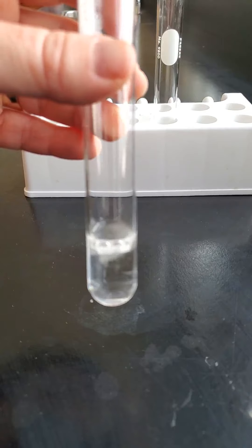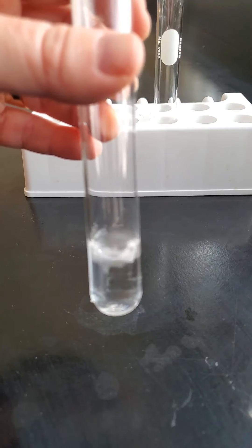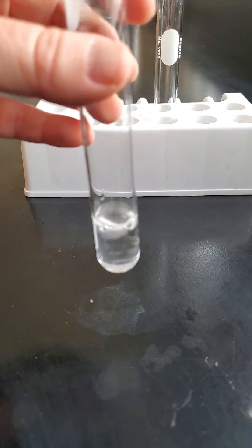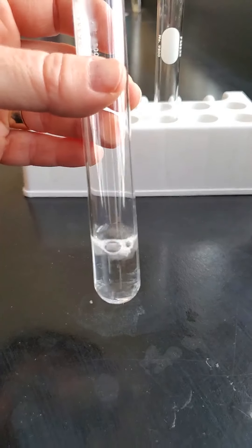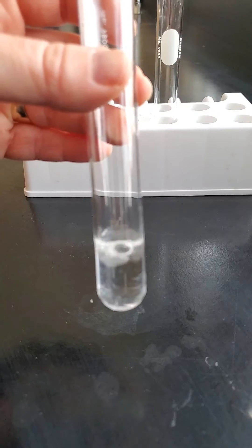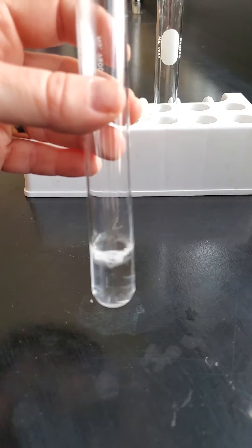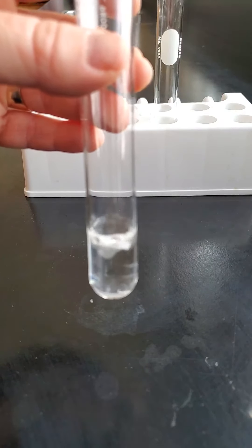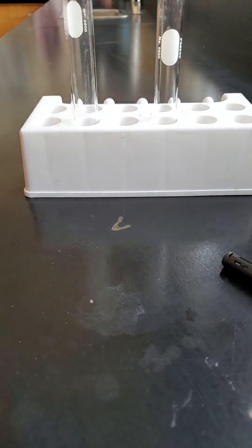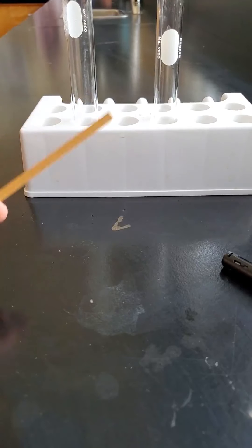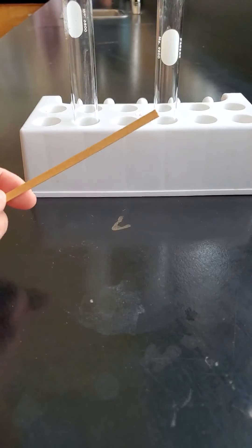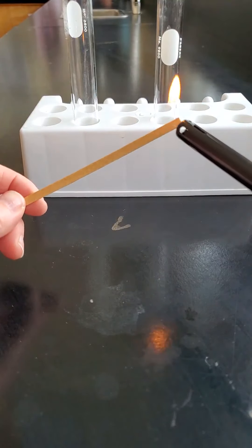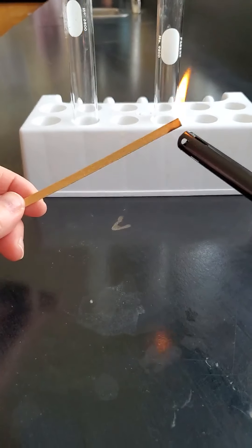Now what if we wanted to test what gas is being produced? We've got magnesium and hydrochloric acid - what do you think those bubbles of gas are? How could we check? Well, we've done this before. One way we can check is by using a burning splint. I've got my splint here and I'm going to light it on fire.